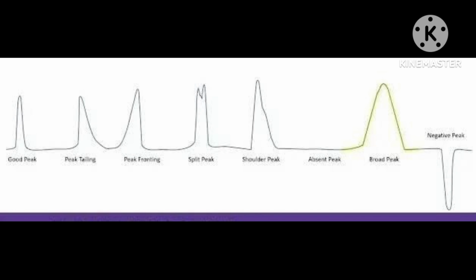Refractive index detection. Water peak. When using RI detection, the water in the sample elutes with a lower refractive index than the mobile phase, causing a negative peak. Blank injection. Injection of the mobile phase can also result in a negative peak due to the RI difference.